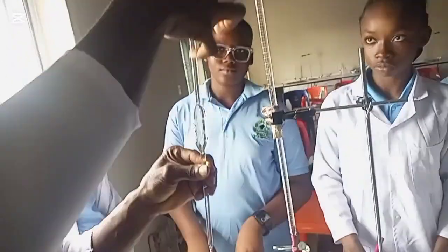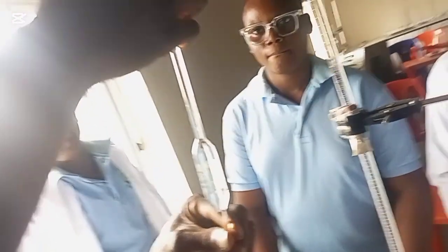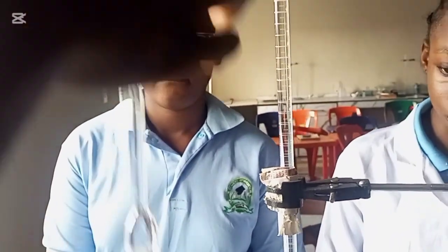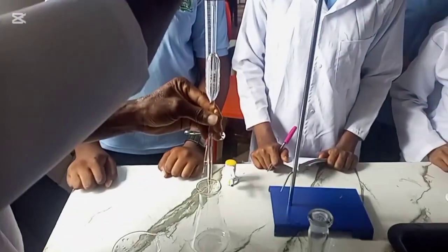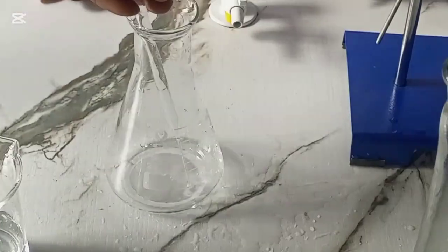So if you watch here, you see a mark. There is a mark, but it's when you draw closer that you see it. That mark is the 25 ml mark. So we need to adjust until it reaches there. Then what we need to do is release it here. We have our 25 ml of base into our conical flask.